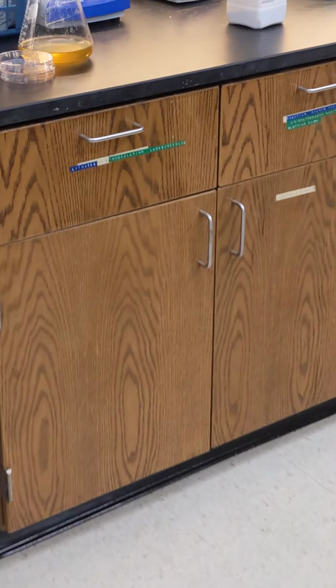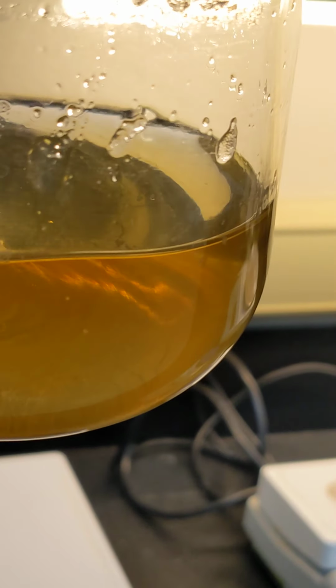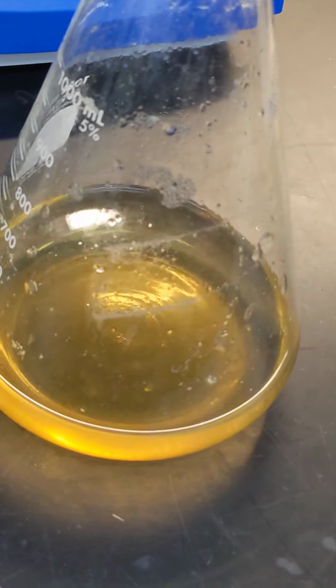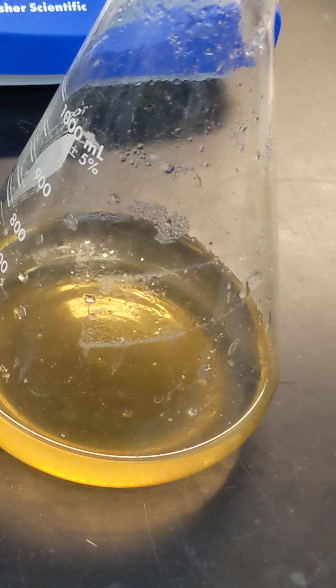Okay. So when a media comes out, and just like a good cooking show, I have something on standby here. It's going to look something like this. This one's been sitting for a few minutes. I've let this one cool. Notice it's still liquid and it's still clear, beautiful crystal clear yellow color. It's really important to let them cool so you don't burn your hands when you're handling them, or melt the plates, or get a ton of condensation that builds up in the plates.